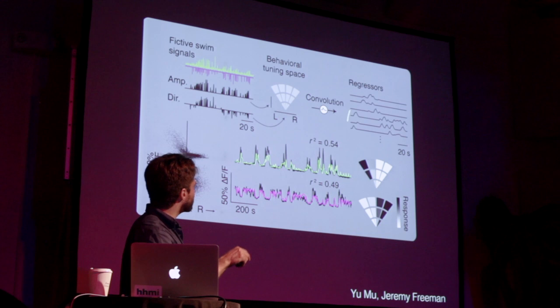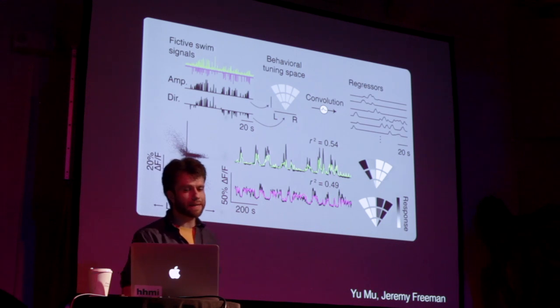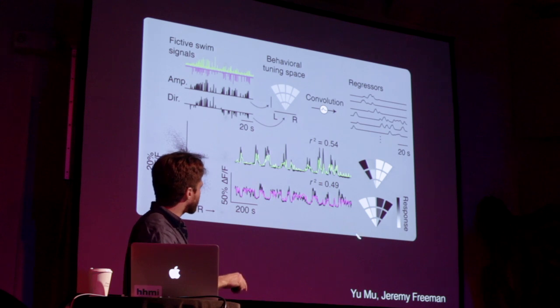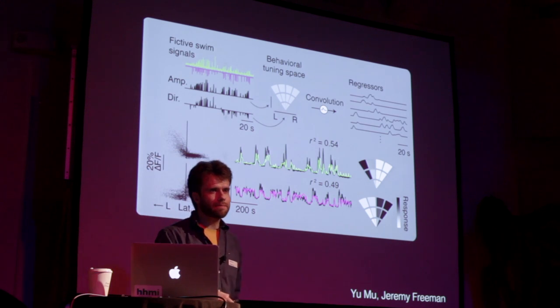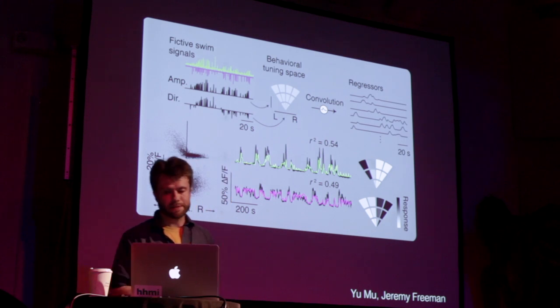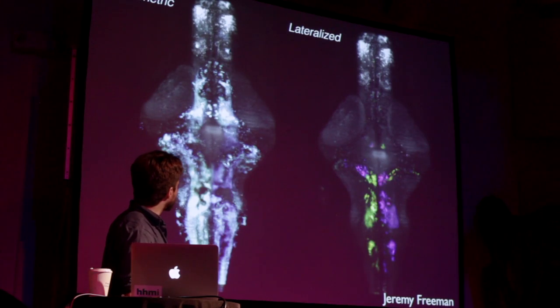We can then turn this into 12 regressors, regress whole brain activity against this, and describe every voxel according to one of these behavioral receptive fields, which are analogous to sensory receptive fields. Now, here are some volumes that come out.